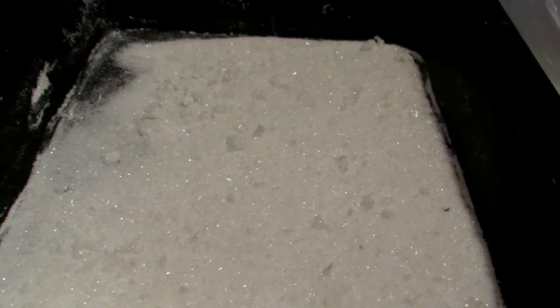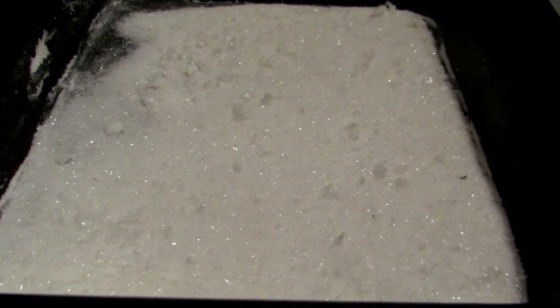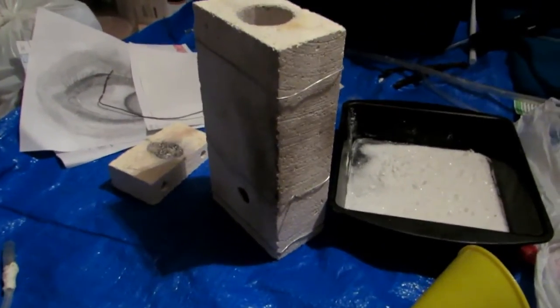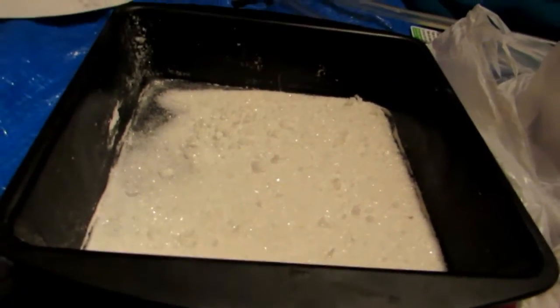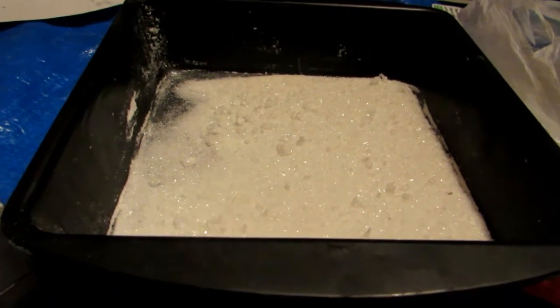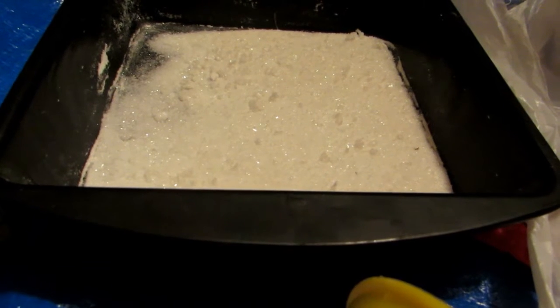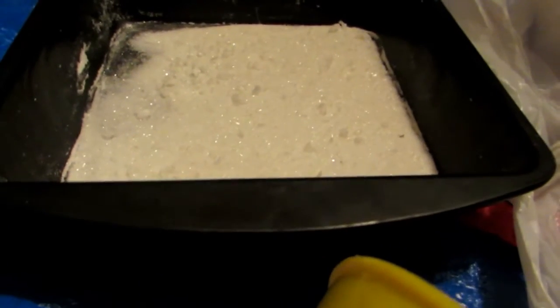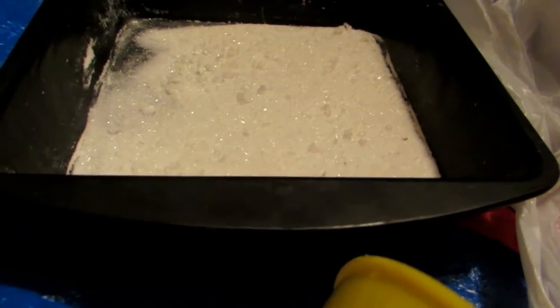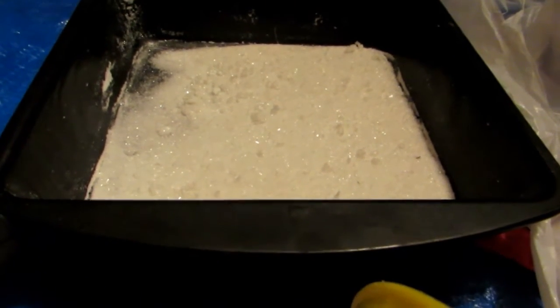Potassium bitartrate decomposes around 250 degrees Celsius, just above the maximum temperature our oven can reach, so the oven won't be sufficient. Instead, I'll use a high-temperature distillation apparatus from a previous video as a crucible to destructively decompose the potassium bitartrate. It will decompose into potassium carbonate, and the organic portion may crumble into carbon, water, and other byproducts. Potassium carbonate won't decompose to potassium oxide until over 1200 degrees Celsius, which a propane blowtorch cannot reach.